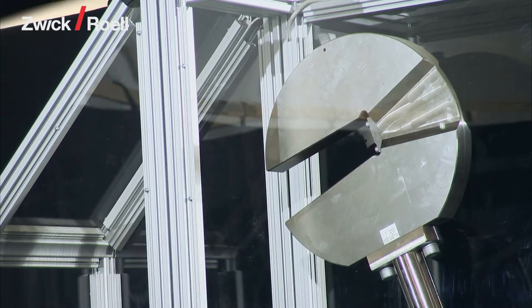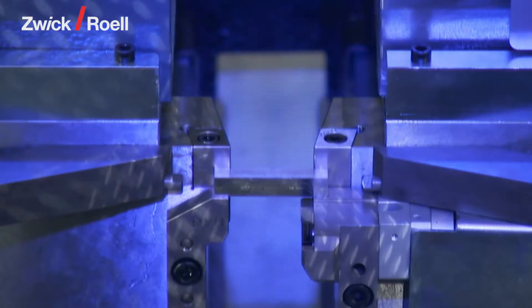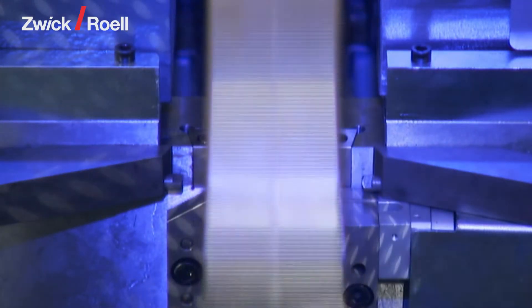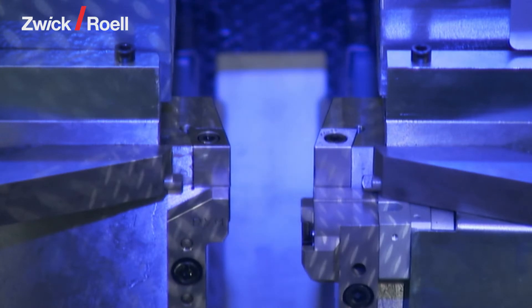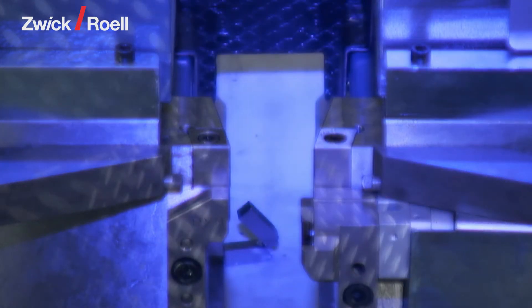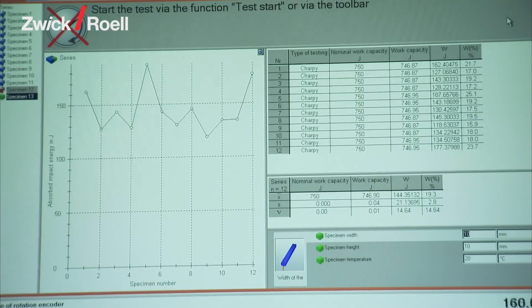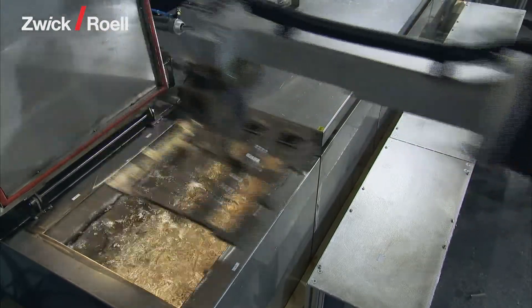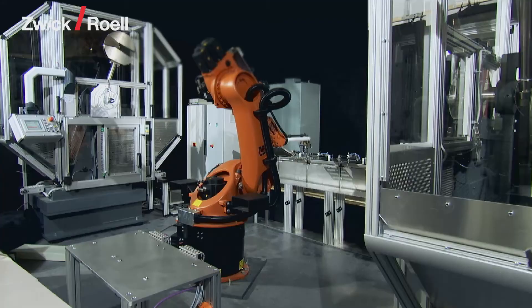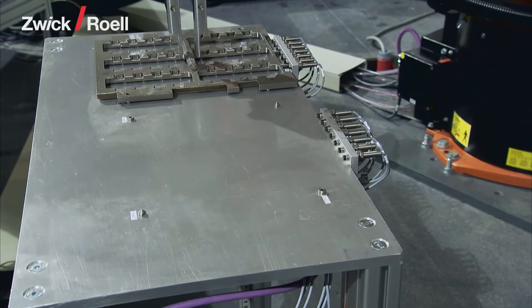The hammer falls and strikes the specimen. Now the sequence once again in slow motion. The test result is transmitted to the TestExpert testing software. The empty magazine is taken back to the return position and is moved from there to specimen production, where it is filled with new specimens.